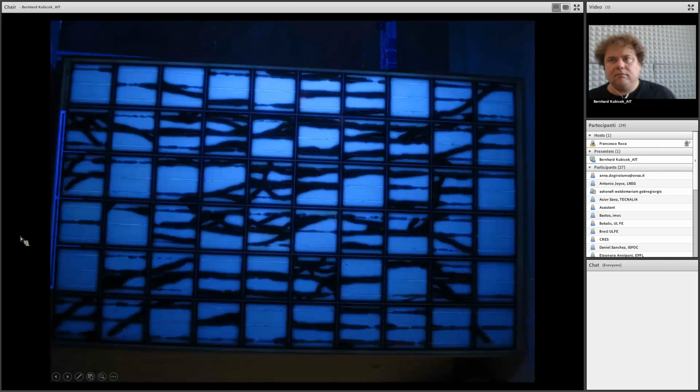If you use this, you will get high contrast images like this one here, where you see a lot of stuff. If you can see the mouse pointer, the left cell here, in the second row, is a typical cell. You have fluorescence in the center, in the core, and then at the boundaries you have black stripes. These black stripes would normally be fluorescing, but due to the diffusion from the backside and some photochemical reaction, the fluorescence gets destroyed. And this also happens here at cracks.